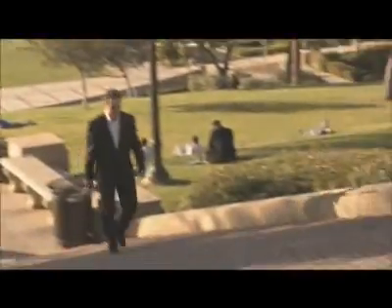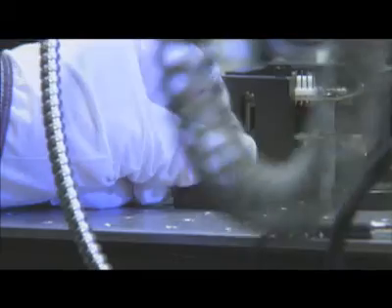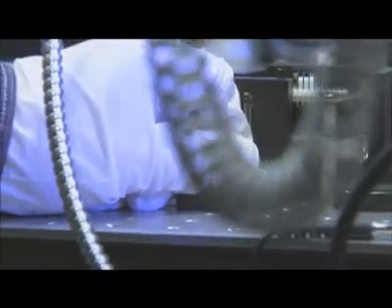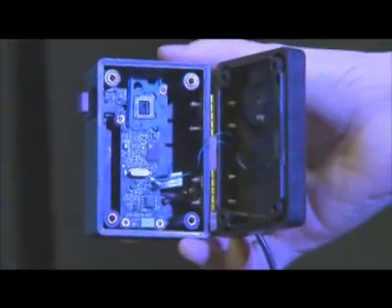When UCLA engineering professor Aydogan Ozcan was a kid, he loved to see how things worked. "Whether it was a camera or a radio or even a pen, I would definitely open it up and look what's inside." And it was breaking into a digital camera a few years back that led Ozcan to a revolutionary invention that could one day reduce the need for expensive microscopes and change the way diseases are diagnosed.